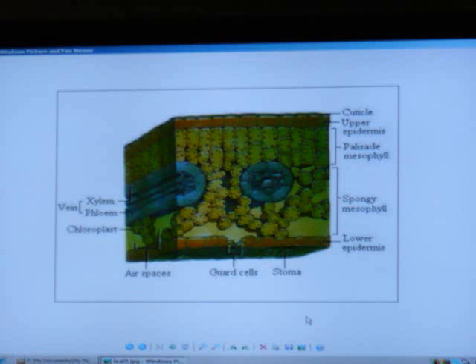And then you see the little dots right there? The little dots are chloroplasts, and they're green. That's where you find chlorophyll. When you did that activity where we had them crawl, you were crushing the chloroplast to get the pigment out and let it crawl up that paper.